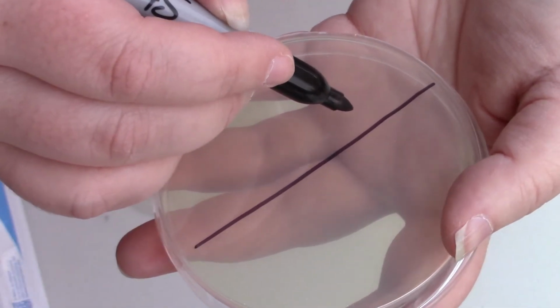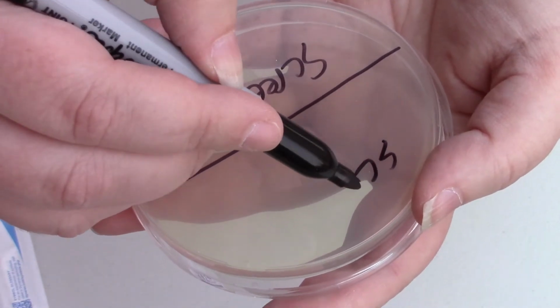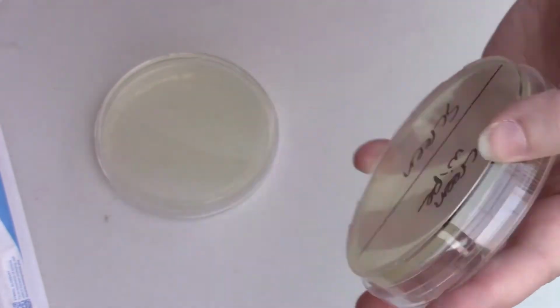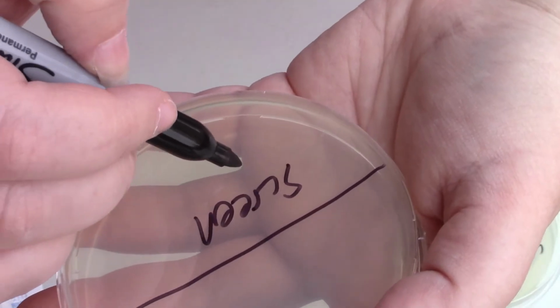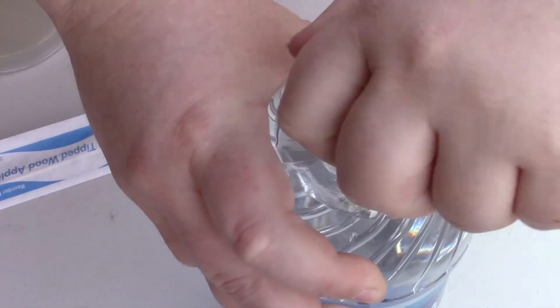This is the second one. So we're going to have the regular screen control and then the screen with our wipes. This way you don't have to use a Petri dish for each thing. You can divide it up like this. Next is going to be the screen with the UV and then nothing on the top for clean control.